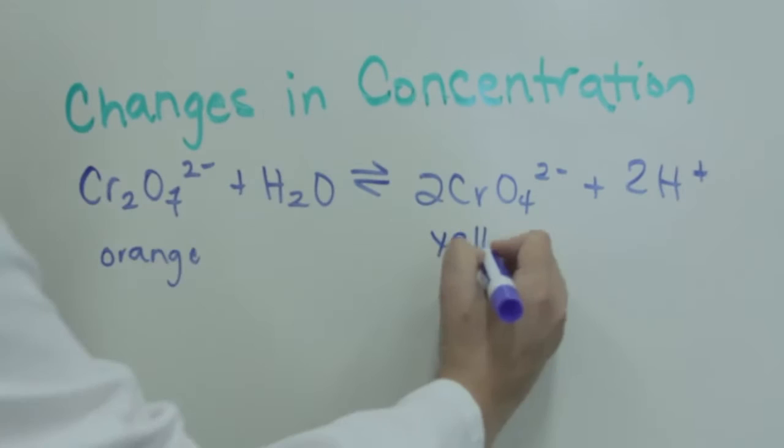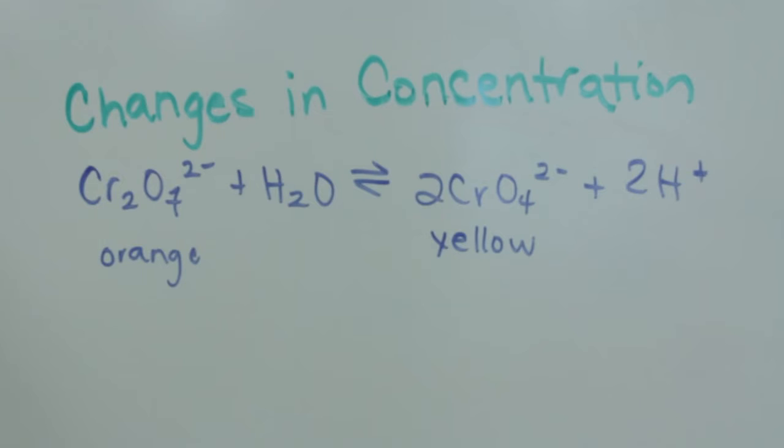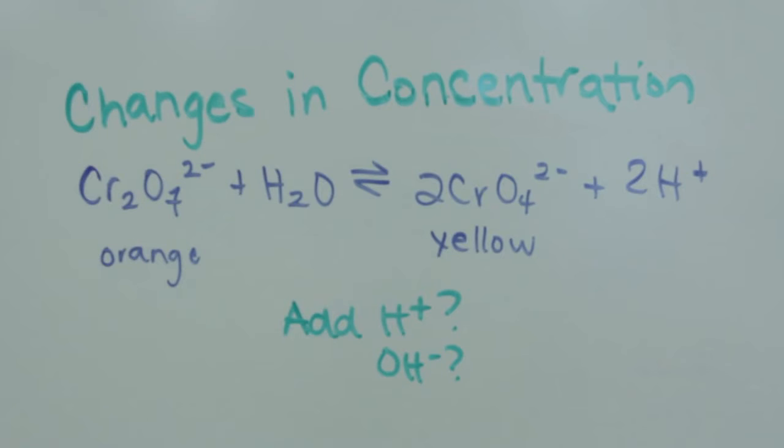The equilibrium that we'll study is one of dichromate in equilibrium with chromate ions. Dichromate is orange in solution while chromate is yellow. We'll observe the effect that adding HCl and adding OH- will have on the system.